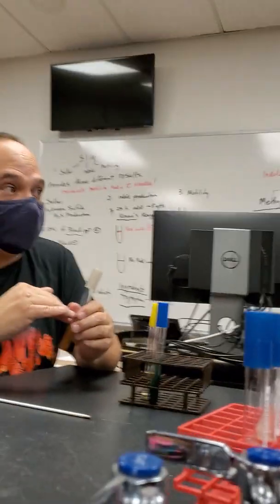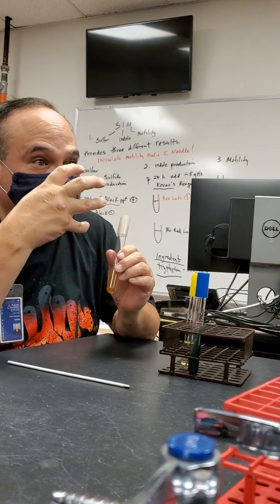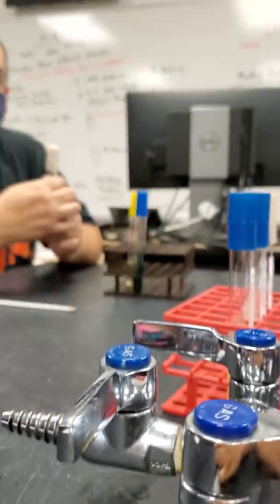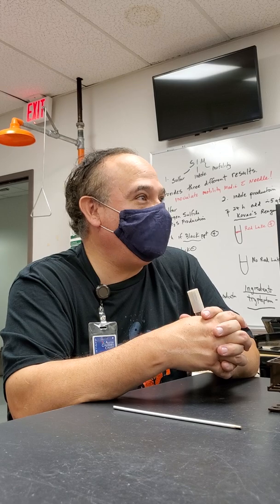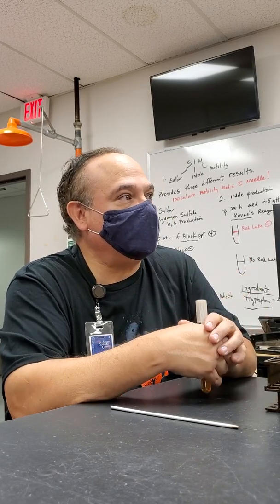But for the scope of this course, we're teaching, we're not really doing analyses, we're learning how to do analyses. If it's black, it's going to be completely black, and we're just going to assume it's motile because the organisms that we've selected that are hydrogen sulfide positive are all motile. That's going to be Proteus and Salmonella.